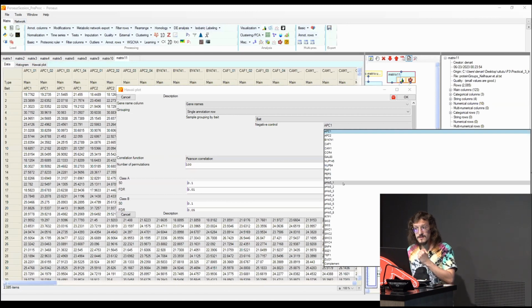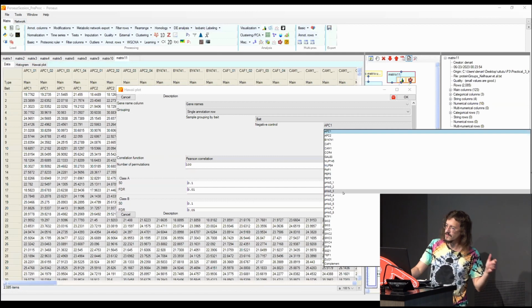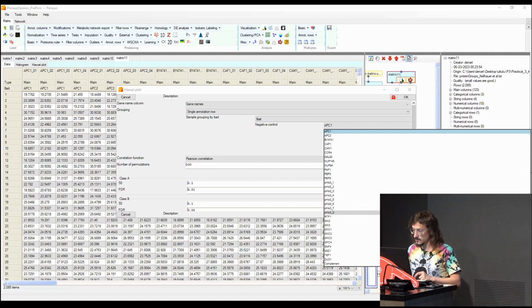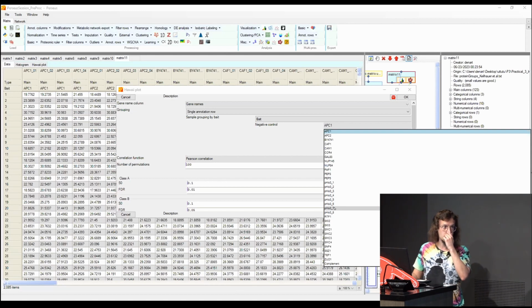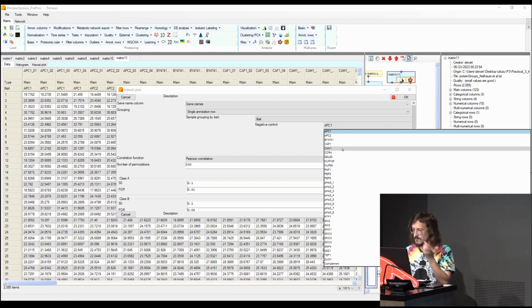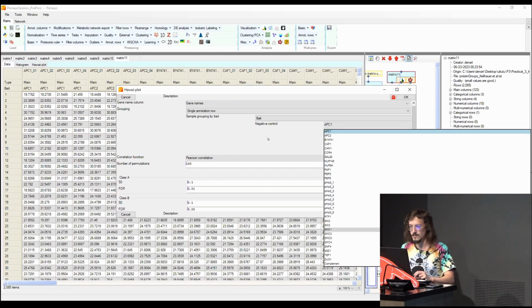The only problem is that in order to do that, I should now rename all the categories, because you see that they've been renamed with the P histone 1, 2, 3, 4, 5. Then I should group them. It's not difficult, only time consuming. But you can try to group them all together, and maybe start with one grouping, maybe 3, 6, and then 8 together, with the same categorical name, and see what changes. And here you can select. If we want, we can also plot everything against one of the baits, if you're interested in that specific thing.